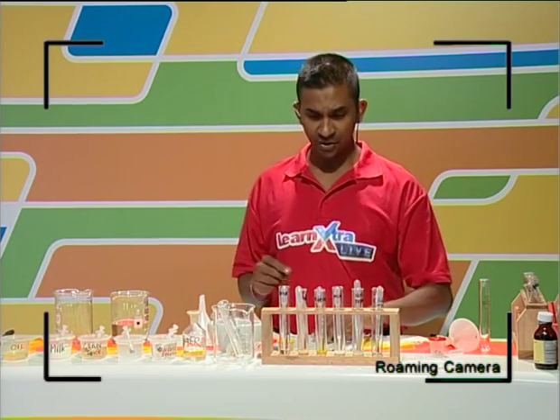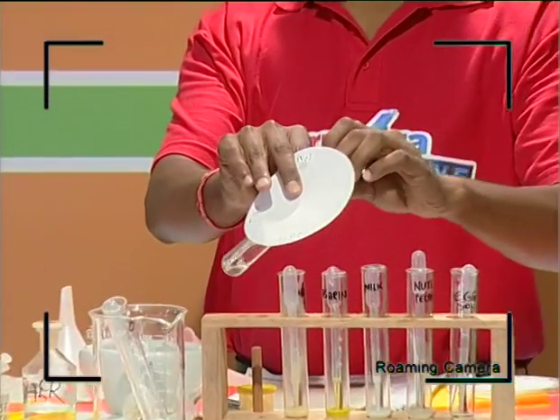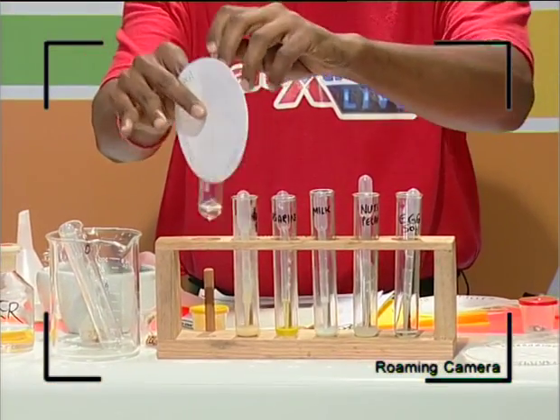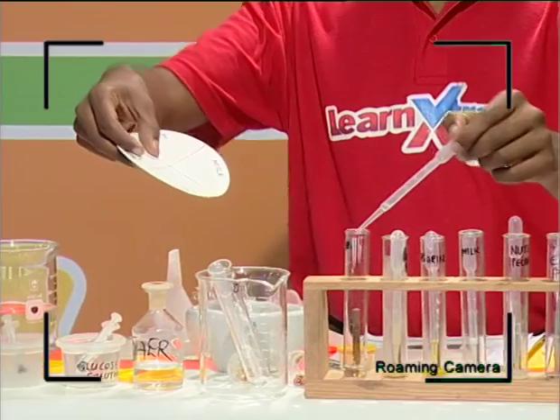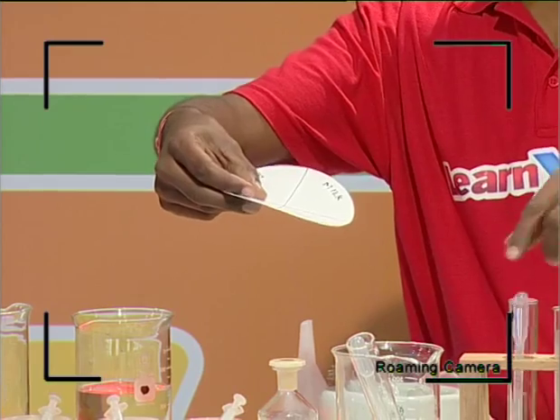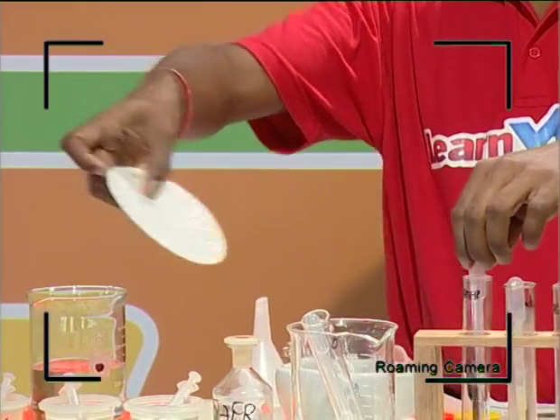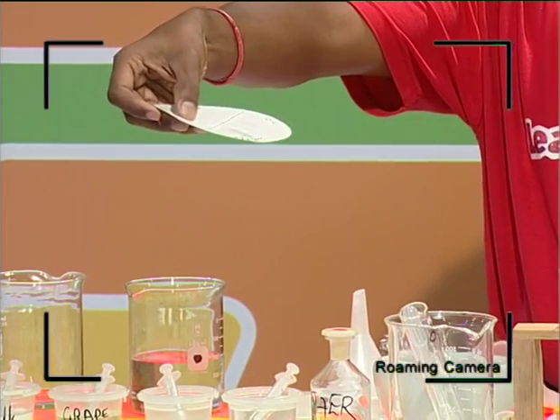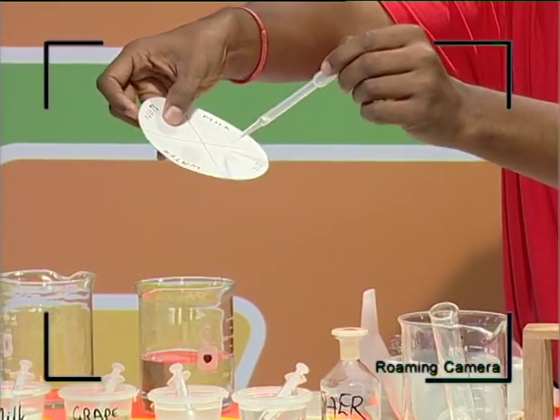Okay, so I'm going to go with our positive control first. Okay, so the dropper plays hard to get, it's stuck in there. Here you go, come out. So that's the dropper. I've taken a drop, and just a small drop, guys. I'm going to drop that right in the middle somewhere. Okay, then I'm going to move on to, let's see. So that was water, sorry. I must have put the water in the wrong place. So that's water here. That goes in there. They can see how thin that runs. And there's oil, guys. So I'm going to put oil back in here.